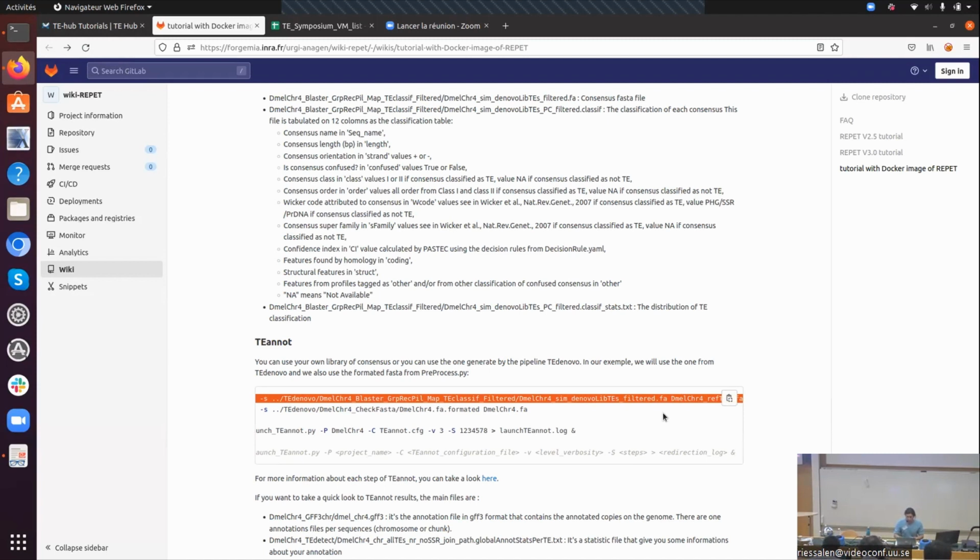If you find some bad commands or commands that remain unclear for you, we are open for feedback and suggestions, or if there is a need for more explanation or additional commands, we can improve it. It's just a first version.